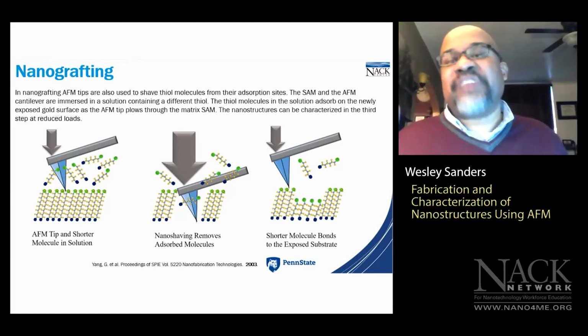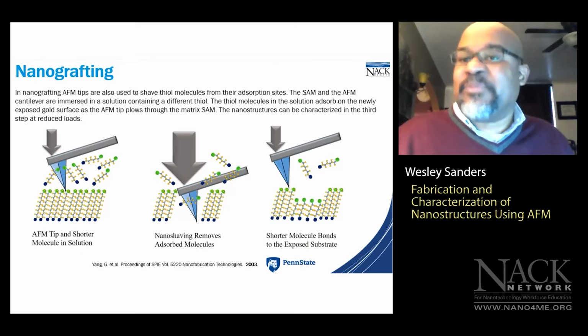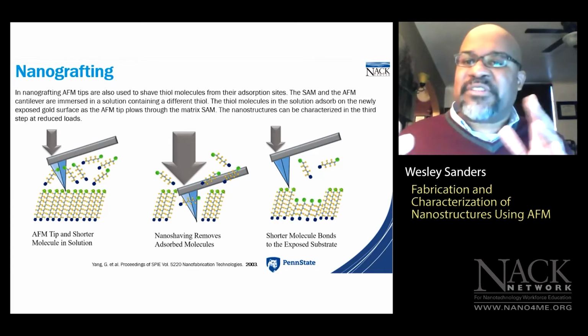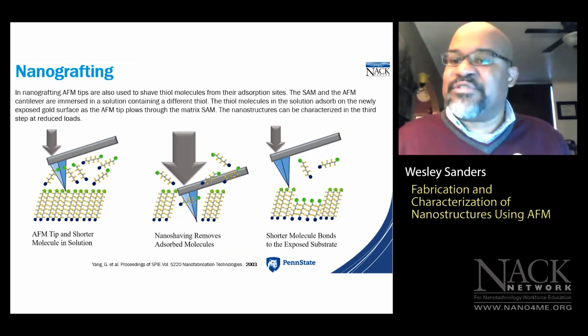Right, sure. Very good question. So the probe motion is controlled by using a scanner. And the scanner consists of piezoelectric materials that have very small increments in terms of movement. So piezoelectric materials are ceramic materials that bend and contract in response to applied voltage, applied potential, right?